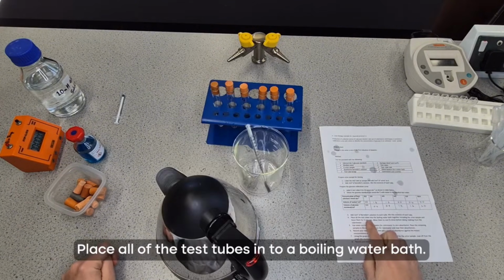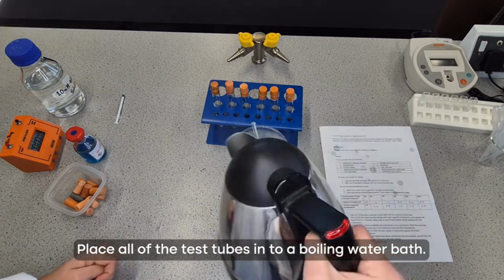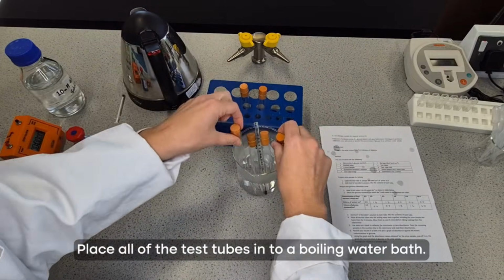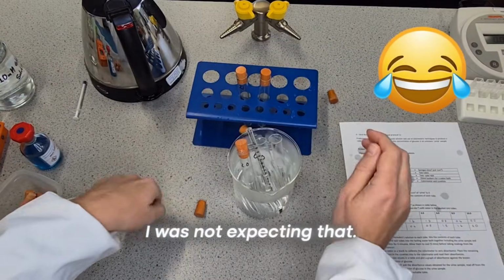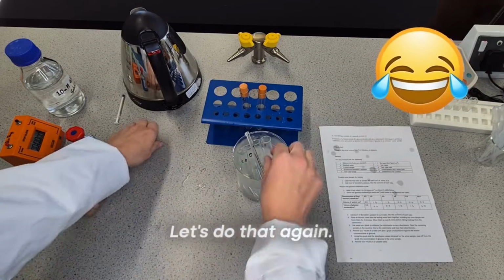So next on our list is we need to place all of those test tubes into a boiling water bath. I'm not going to completely fill it because when you add the test tubes, that displaces the water, so it's going to, oof. I was not expecting that. Don't want the bungs on anymore because we've mixed it. Okay, let's do that again.